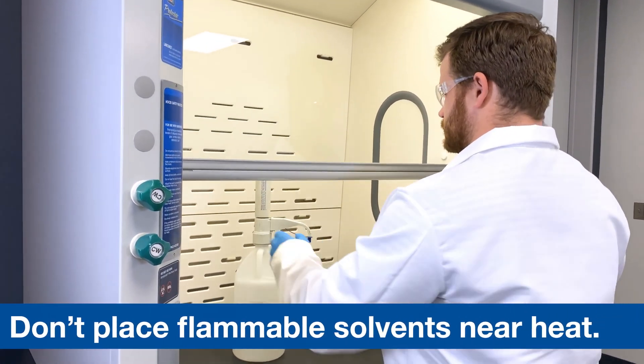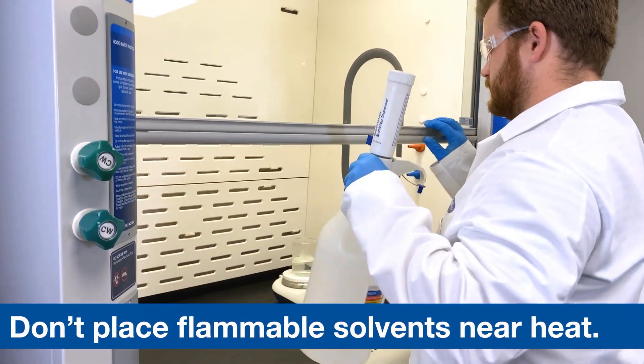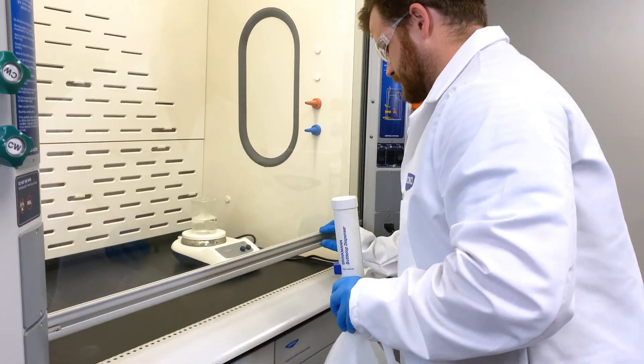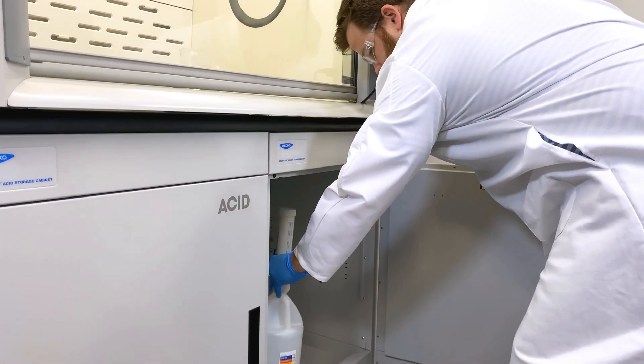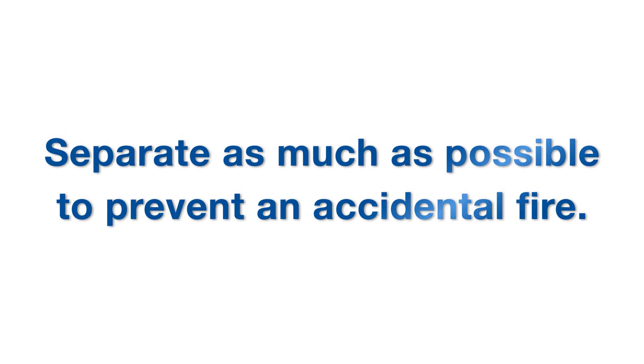Do not place flammable solvents near heat, flame, or sparks. If flammable materials and heat sources must coexist in the same hood, take great care and separate them as much as possible to avoid an accidental fire.